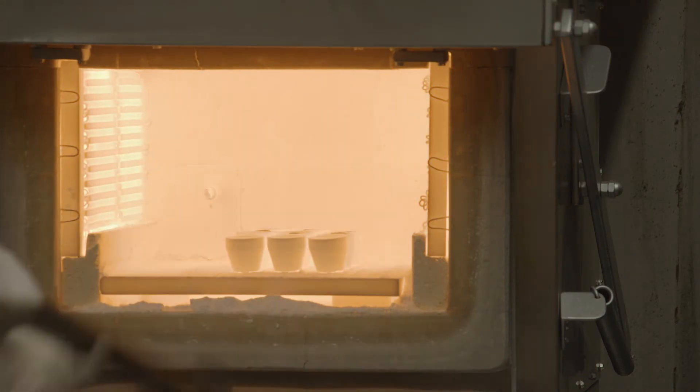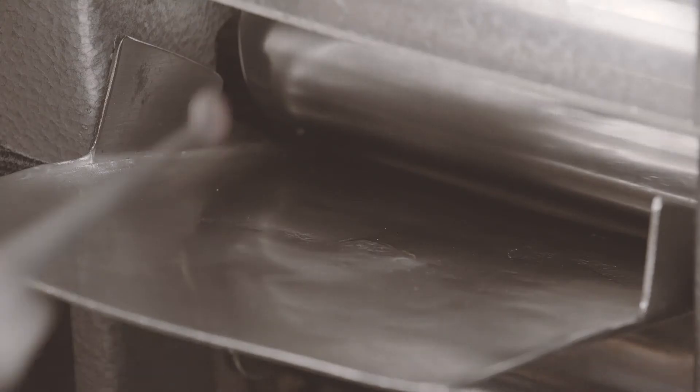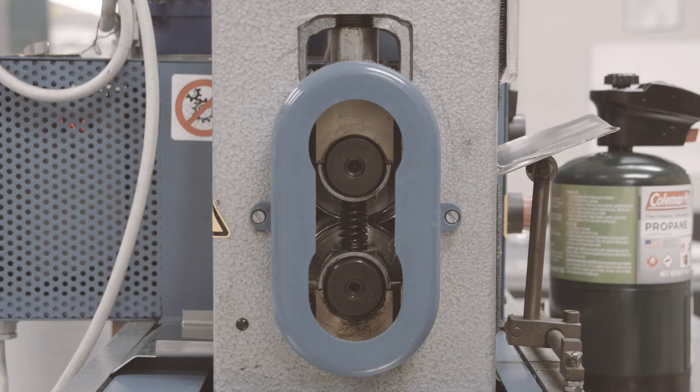From there, only silver and gold remains in the sample, which is then rolled several times and placed back in the oven.